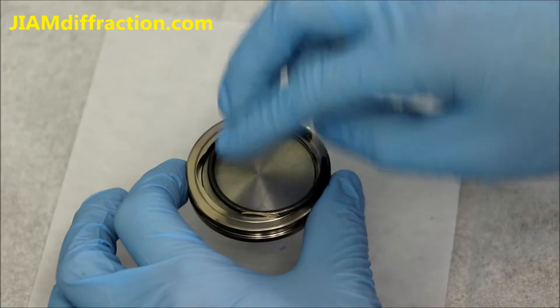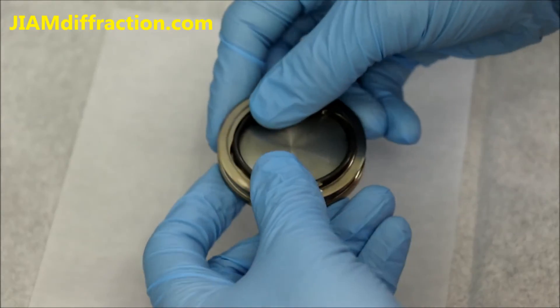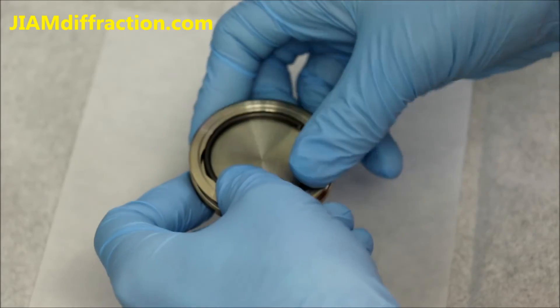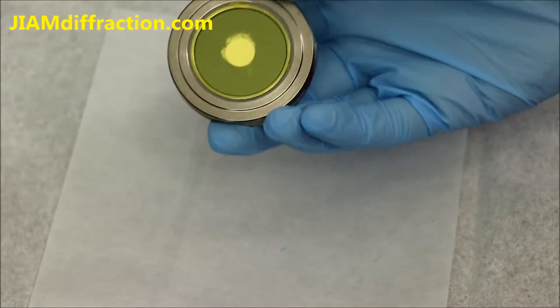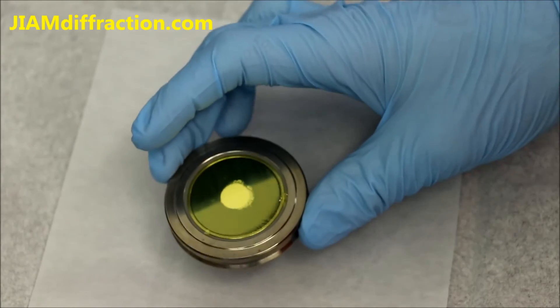We will insert the securing ring. And this can be a little tricky sometimes. Now it's easier than usual. Now we flip it back over and we have a sample ready to test.